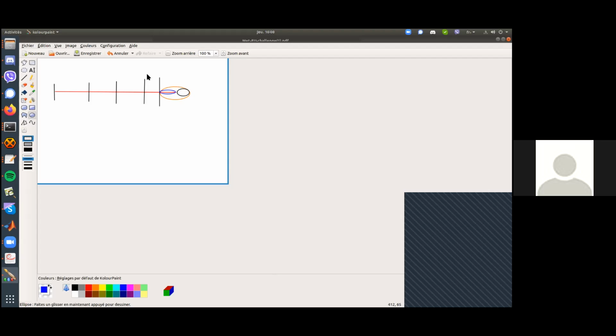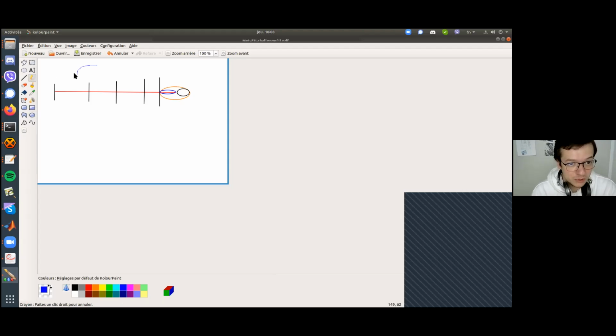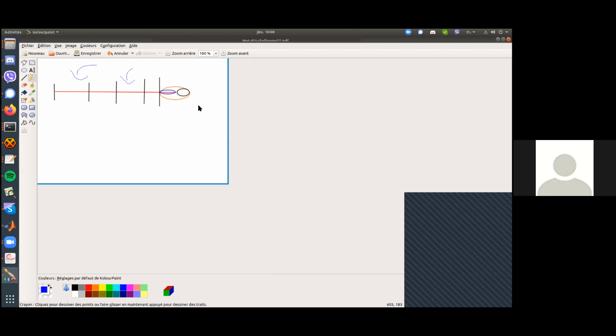Of course. But this part doesn't exist in that case. When you create your matrix, you have reads. Reads are of 200 base pair. So you just count where they are and you put the number of times you see it on each bin. If I draw, you put some reads here, some reads here, and you just count for each region how many reads you have. So you just put the numbers that you have, and yes, it's not complete, but it's the last bin, so it's a compromise. Last bins are not always perfect.